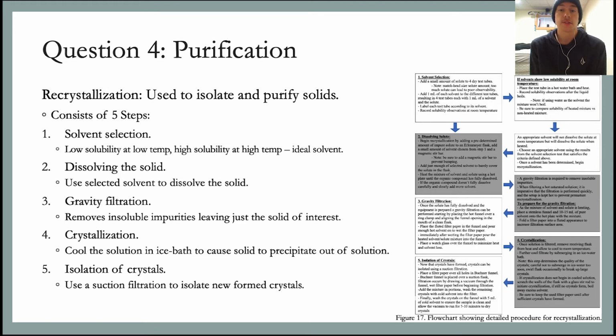To choose the ideal solvent, solvents are compared, and the appropriate solvent will have little to no solubility at room temperature and very high solubility when heated. Next, we dissolve the solid using the selected solvent. Then we perform a hot gravity filtration to remove insoluble impurities from the solution, leaving only the solid of interest.